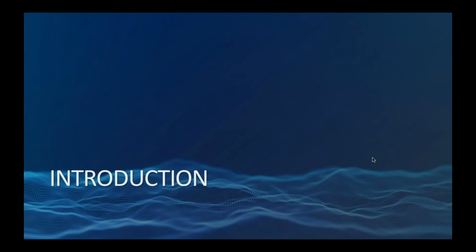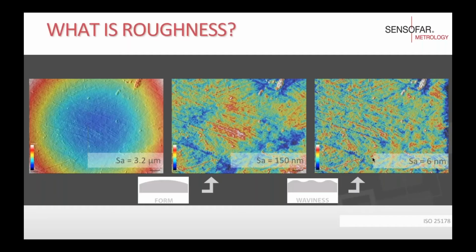So now let's go and start with the topic of today. What is roughness? Here we have 3 different topographies, and those are topographies of intraocular lenses, but what we see here is the same topography with different filters applied. The first topography on the left is without filters. In the one in the center, we have removed the spherical shape of the lenses.